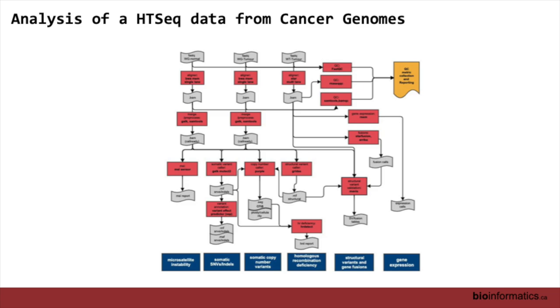We run this pipeline not just for the clinical reports, we do a lot of research work with it as well. As Bernard mentioned, it's an accredited lab. The pipelines are all accredited, validated, tested as well. And while that work was mostly done for clinical reporting, these pipelines are also used for our research. People who come do research here, or do sequencing here for research projects, are able to work with an accredited pipeline.